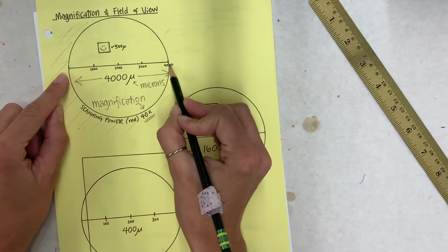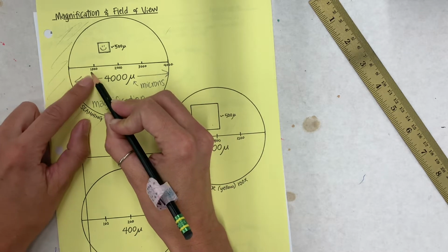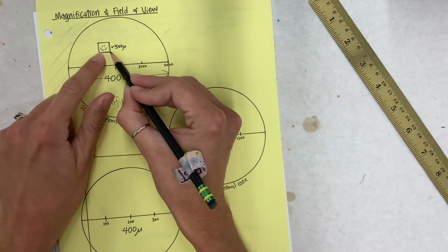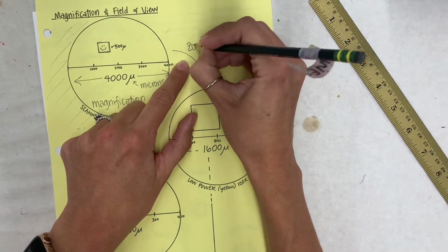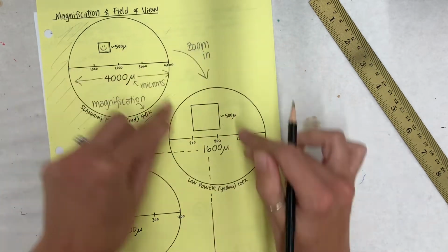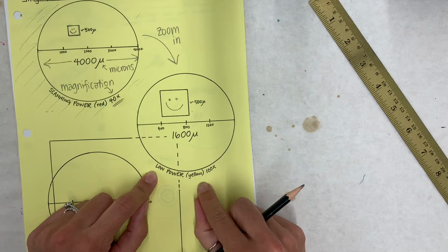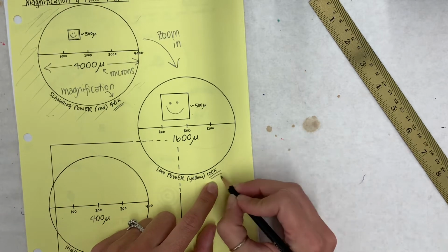This unit is much smaller than units you see on a ruler because we're dealing with teeny tiny things. So across the field of view is 4,000 microns. Halfway would be 2,000 and everything in between, right? So if our specimen here is about 500 microns in size, it views pretty small right here. So the thing we would want to do is zoom in on the specimen so that we can get a closer look. When we zoom in, we can see our specimen a little bigger, and that would be on low power with the yellow objective lens, and that is 100 times magnified.